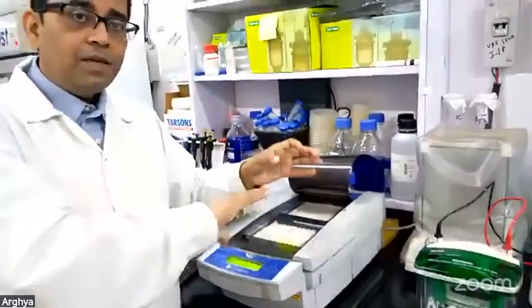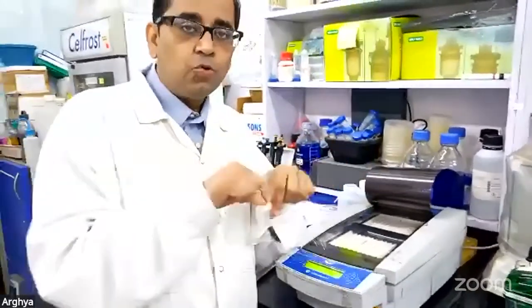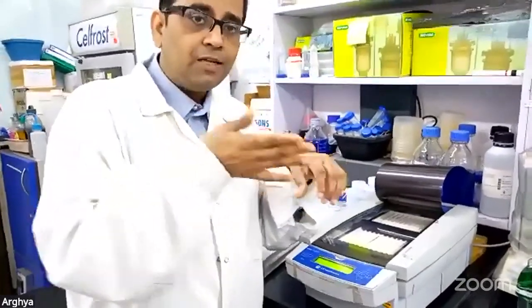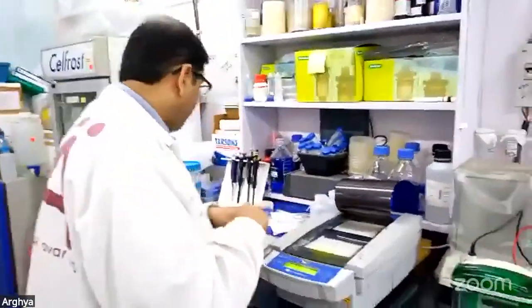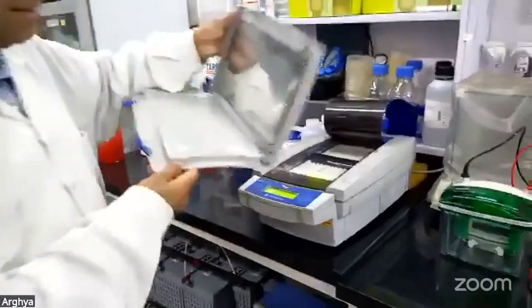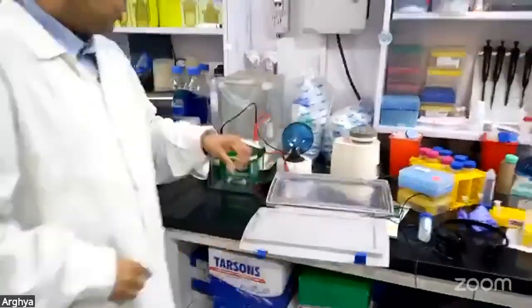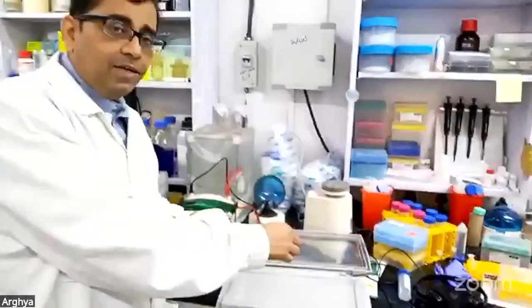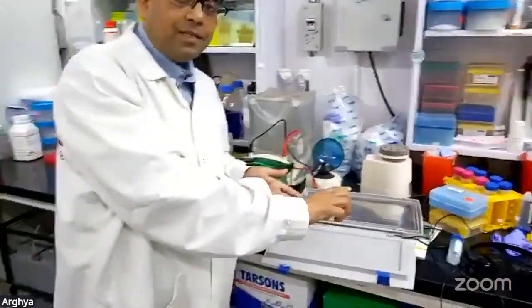After this step, we have to prepare our IPG. Let's say proteins have now moved to their PI value, the pH value where the net charge is 0. Now you will take this particular IPG strip and place it in the tray like this, and you are going to clean that IPG strip with different equilibration solutions.